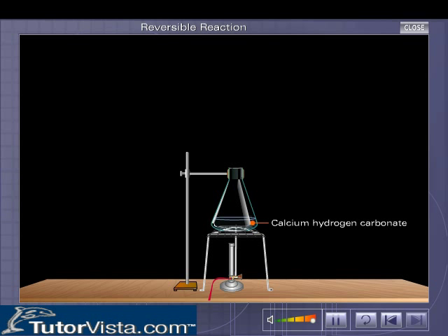Now let us see what happens when we boil this clear solution of calcium hydrogen carbonate. We can observe that the clear solution is now gradually turning milky. Why does this happen?